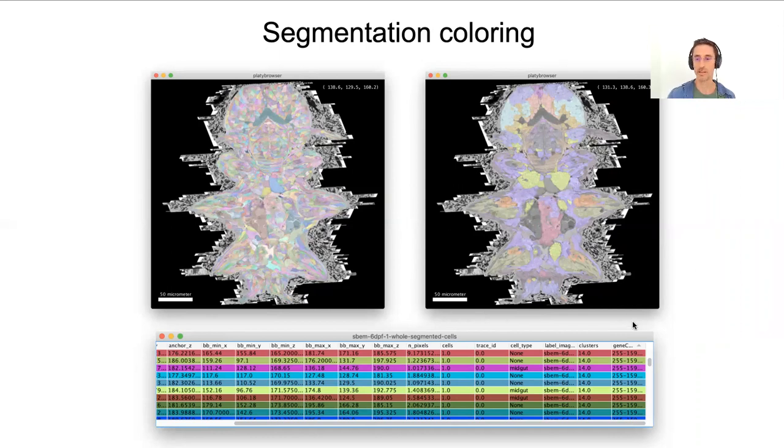And here all the cells should have the same number and then the same color if they correspond to the same gene expression cluster. So you can color here by any column of the table, and like this. Also, I think it's very convenient for biological discovery.